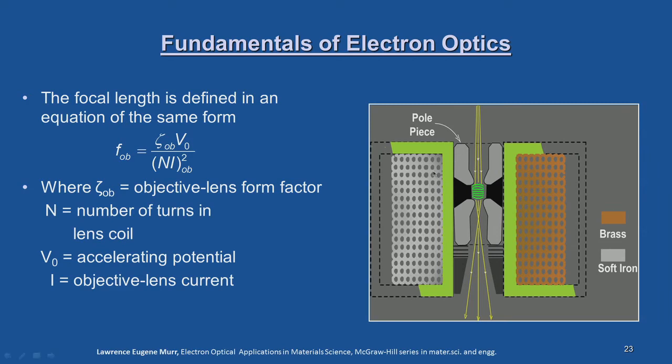You can see that it is slightly bigger. Even if you go back to the schematic diagram we have shown, the objective lens is always shown much bigger than the condenser and other intermediate lenses because of this special action of the objective lens.